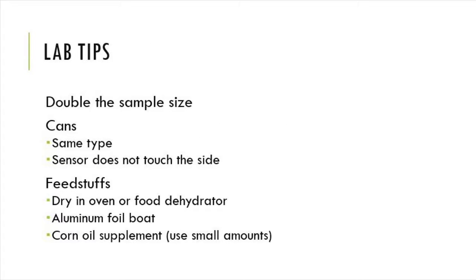Some quick tips: consider doubling the sample size if you have had failure with the three grams of feedstuff samples burning — go ahead and double it and see what happens. Next, make sure that your cans are the same type. If you have a large monster can for one lab station and a juice can for another, you have different surface areas and metal components and they're going to conduct the heat energy from the feedstuff a little differently.